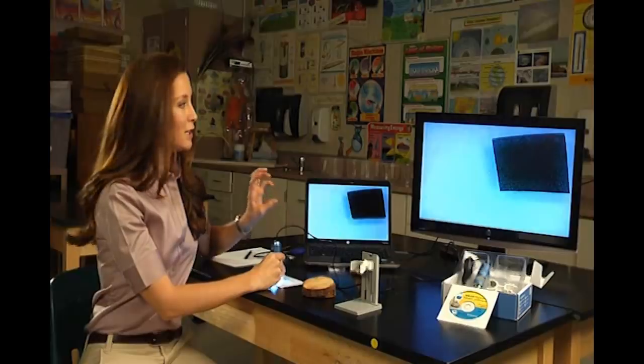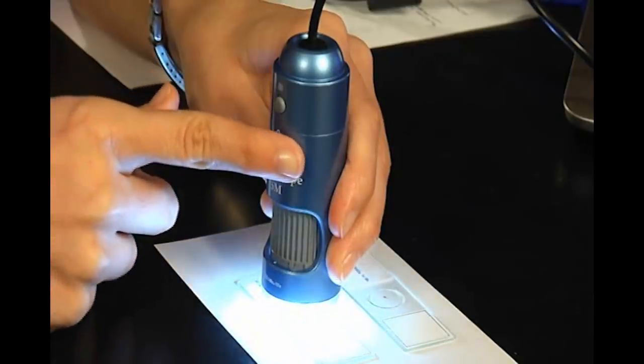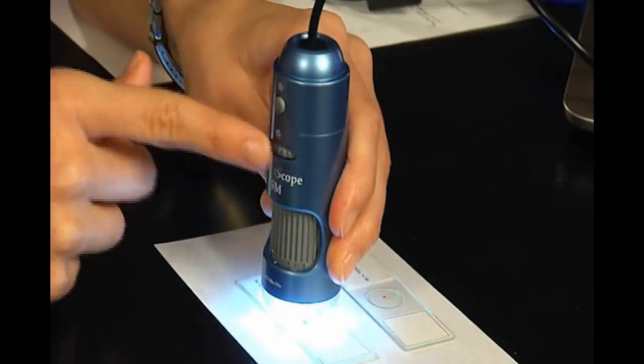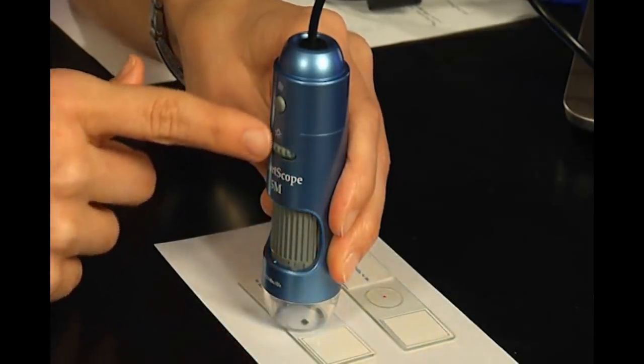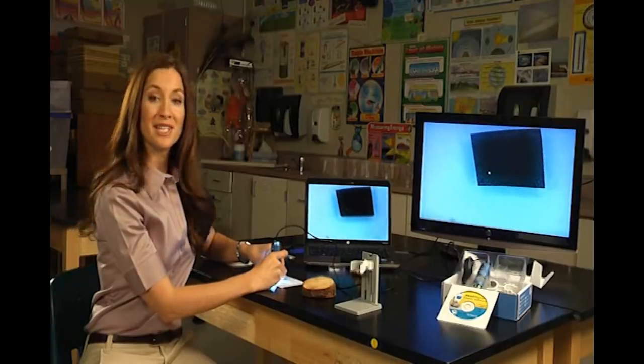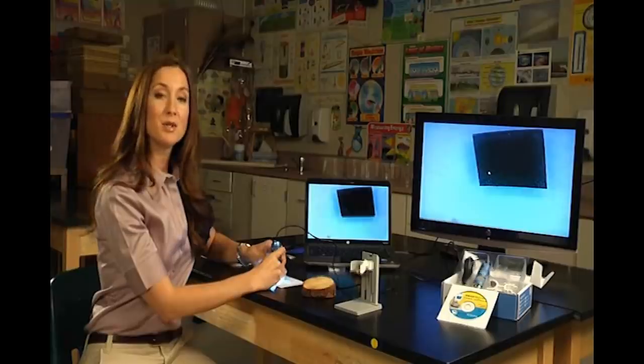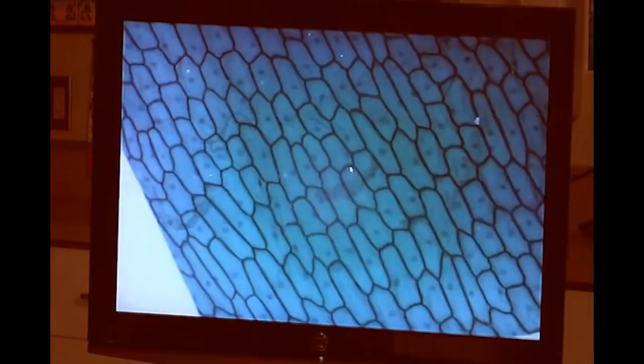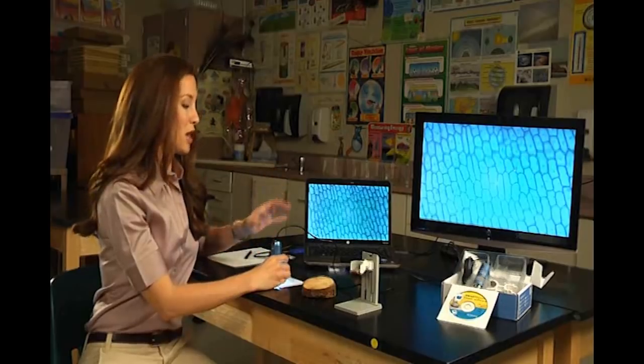This is at 100x magnification. It looks a little dark so I'm going to turn up the light on it. That's the middle dial. You can see you can adjust the light as well. So I'm going to turn it all the way up and get a lot of good light on that so we can really see it. And then you can even zoom in more. Continue turning the dial to the left. And you can see the onion skin at 200x magnification. I think this is a great shot.